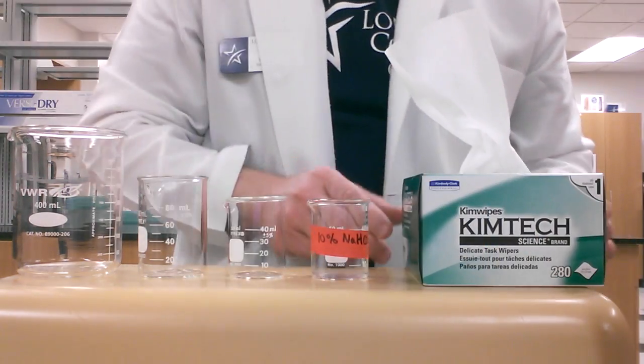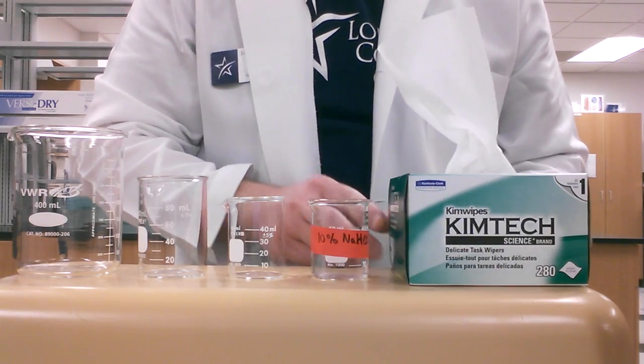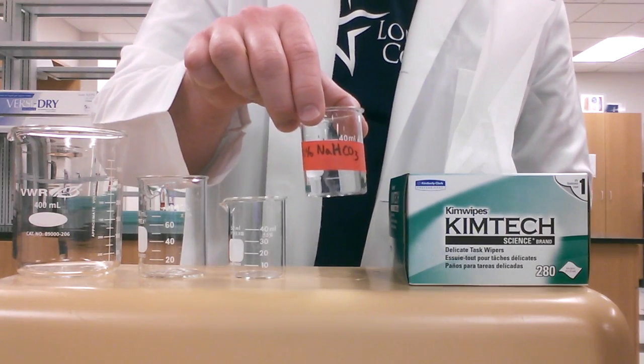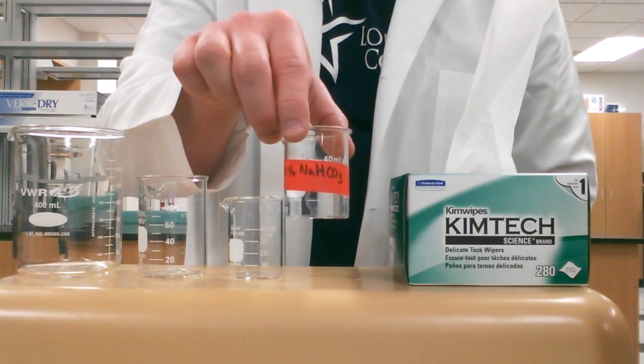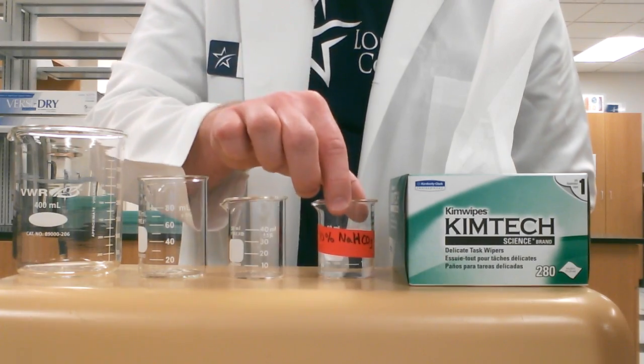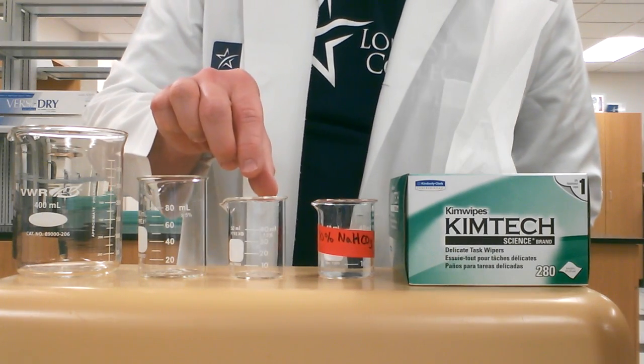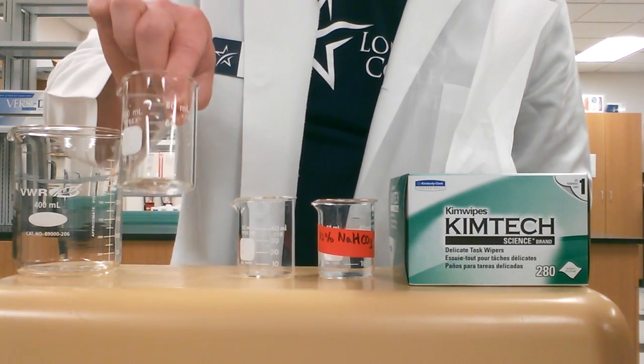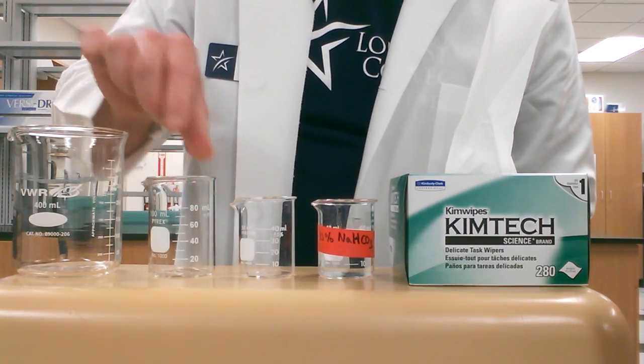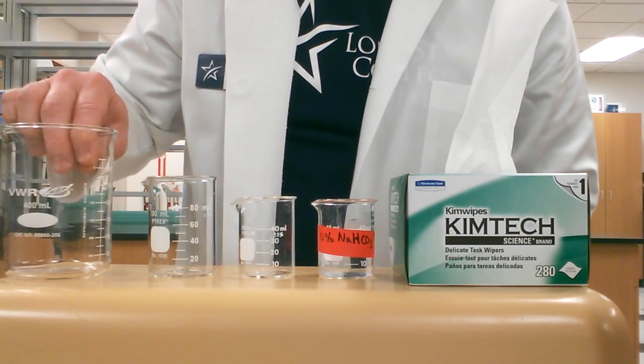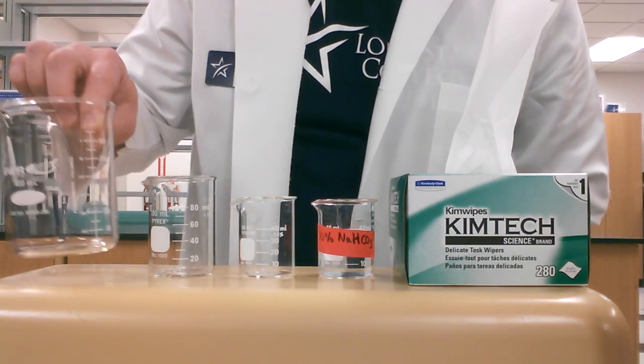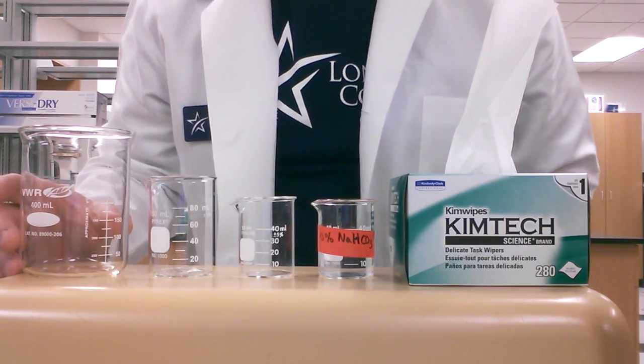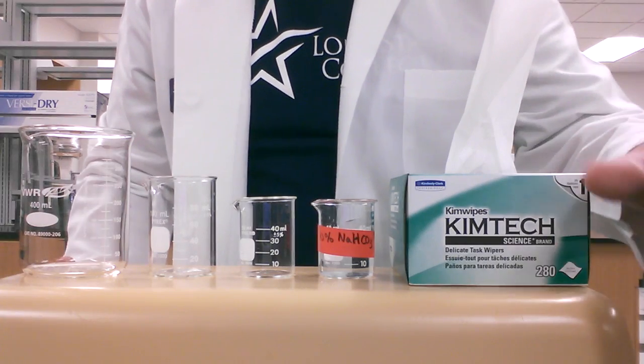The first thing you're going to need is some chem wipes, the solution that you're going to measure. In my case, I have a 10% sodium bicarbonate solution. Then you can use either a small 50 ml beaker or a 100 ml beaker. I also have a larger beaker you don't have to use, but I'm going to use this for a rinsing step because I don't have a sink right here.